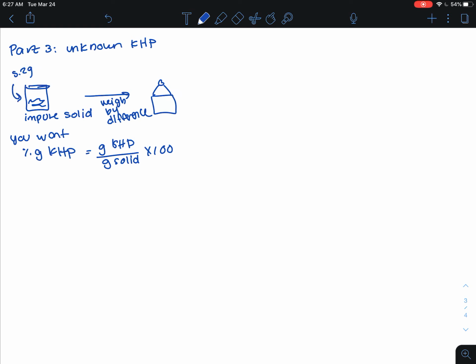now, you can calculate how much you want on your vial, there's a number of your goal of mass. And then think about it. If you have, let's say this was 5.2 grams on your vial, right? And you want to make sure that you can do 3 good titrations. But you don't know if you're going to exactly have 3 good titrations on your first 3 trials. So let's say you want to do 5, just to be safe so you have enough sample. So do you want to weigh out the 5.2 and then dissolve all of that?